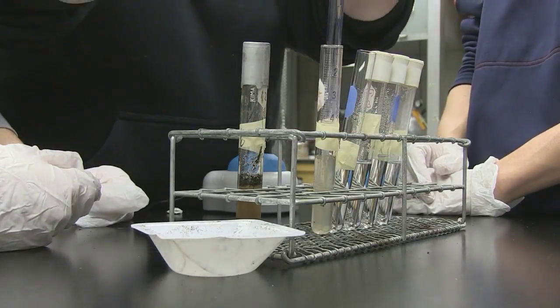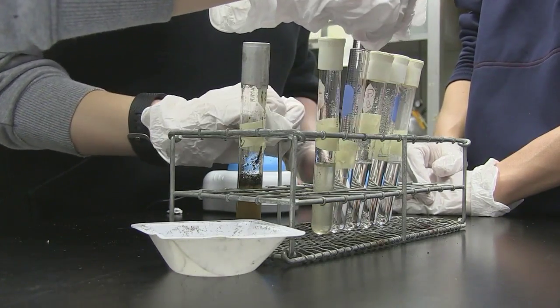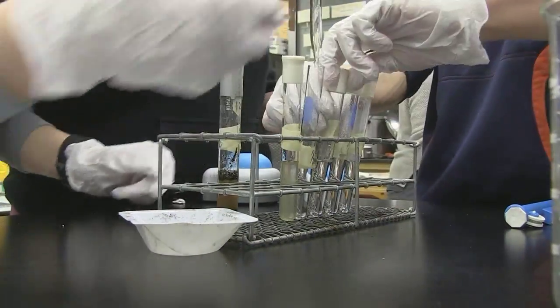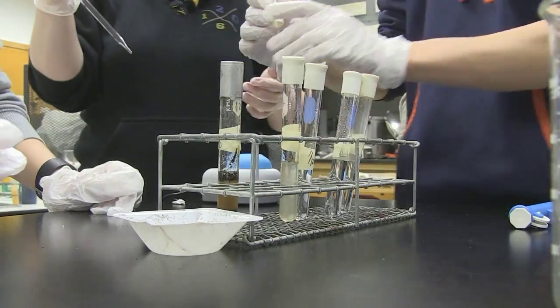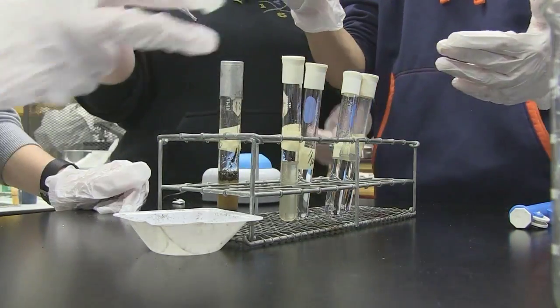Because the soil has so many bacteria in it, we had to dilute it out. All the students had a series of test tubes with nine milliliters of broth, and they added one gram of soil. They continued to do a dilution from that first tube into the next tube, making it a ten times dilution, and they did that for several tubes.